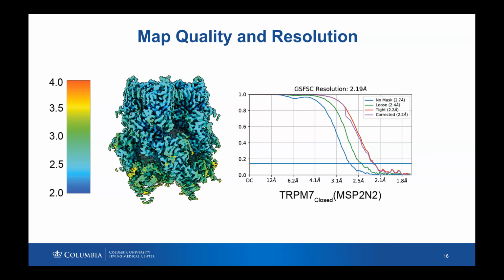And we actually added ruthenium red. This is a channel blocker. It is not specific, but it is a channel blocker, and it also blocks the TRPM7 channel during protein purification. And we had to add an extra amount of this inhibitor when we did protein expression for gain of function mutations, twice as much at least, to give the cells a chance to survive while they were overexpressing the channel.